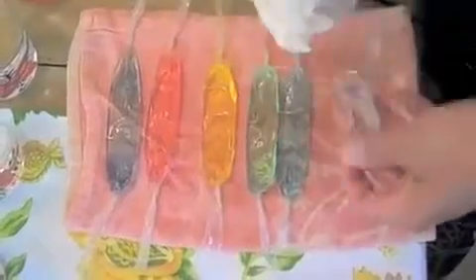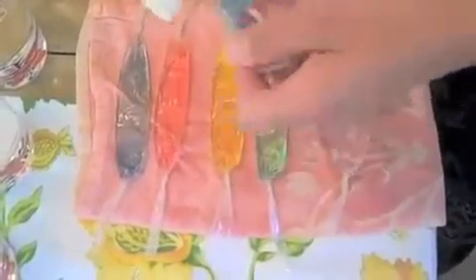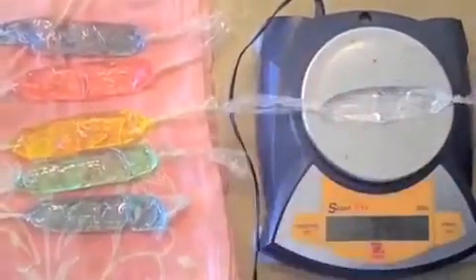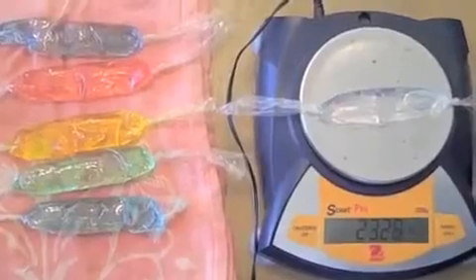Next, each dialysis bag is wiped to remove any external liquid, which would alter the initial weight of the bag and throw off the data. Then, each bag is weighed individually to record the initial mass.